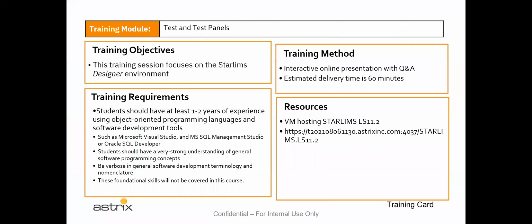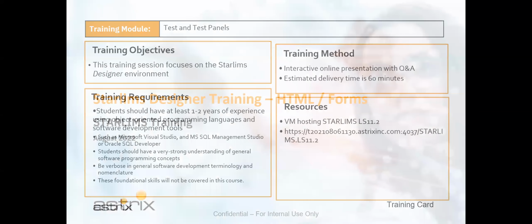And I can tell you that that's something that I would have vastly appreciated when I first started taking my initial training with the STARLIMS system back in 2007. I think I may have mentioned in the previous training that at that time the version 10.0 was brand new. There wasn't even, it looks like it's automatically doing some stuff here. I didn't want to do that.